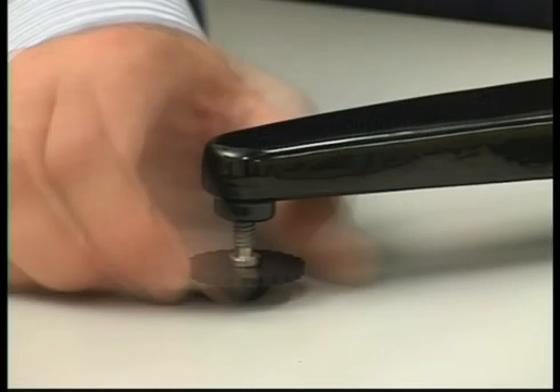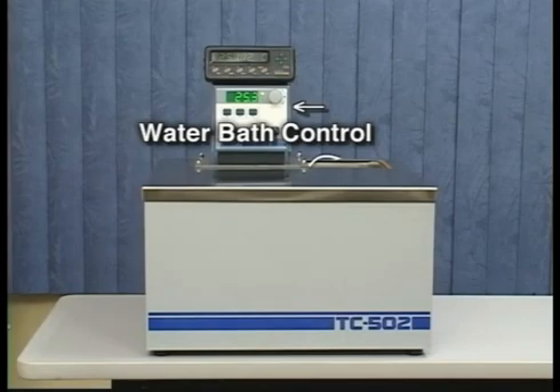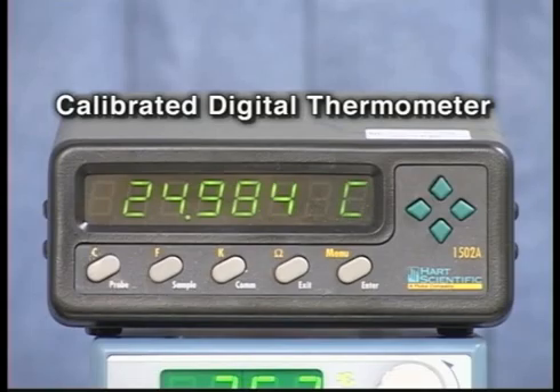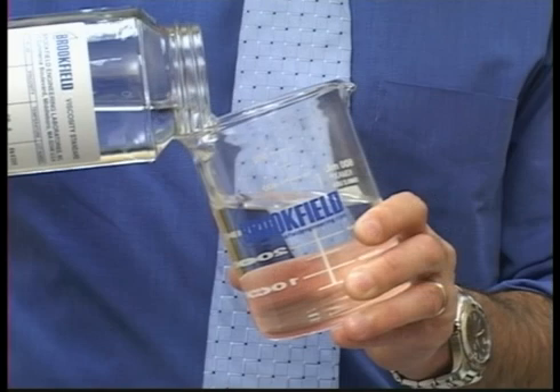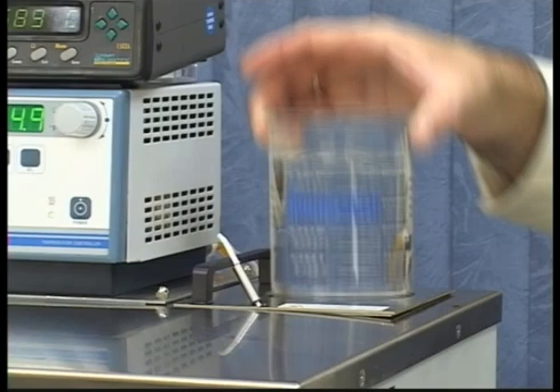Make sure the instrument is level. The viscosity standard fluid needs to be equilibrated at 25 degrees Celsius to get an accurate reading. Fill the 600 milliliter beaker with the viscosity standard fluid and place this in the water bath.